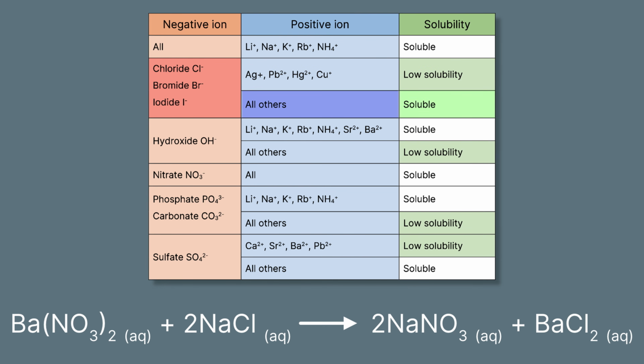Oh well, too bad. Let's try the other possible candidate, sodium nitrate, as a possible new compound from that mixture. So again, we find nitrates, and you might recall, all other pairings with nitrates, basically all nitrates are soluble. So that's why we didn't get any result from that just previous example, our demonstration. So now the question is, what can I do to try and find something else I can mix in here so I can actually show you something meaningful as my third demonstration?